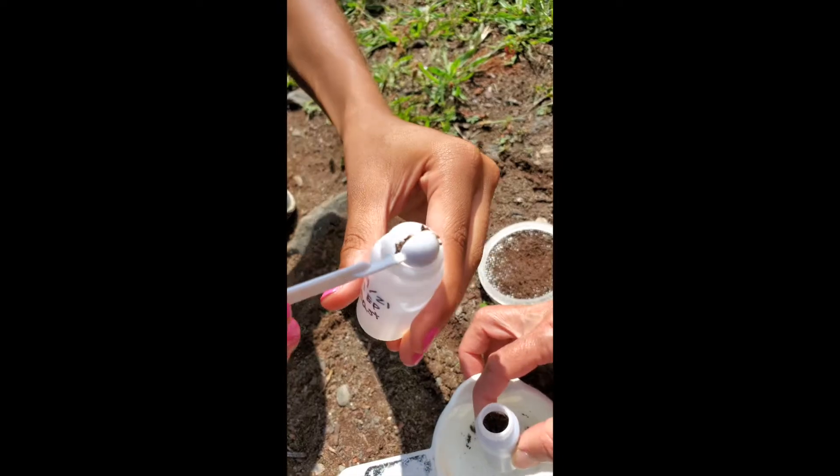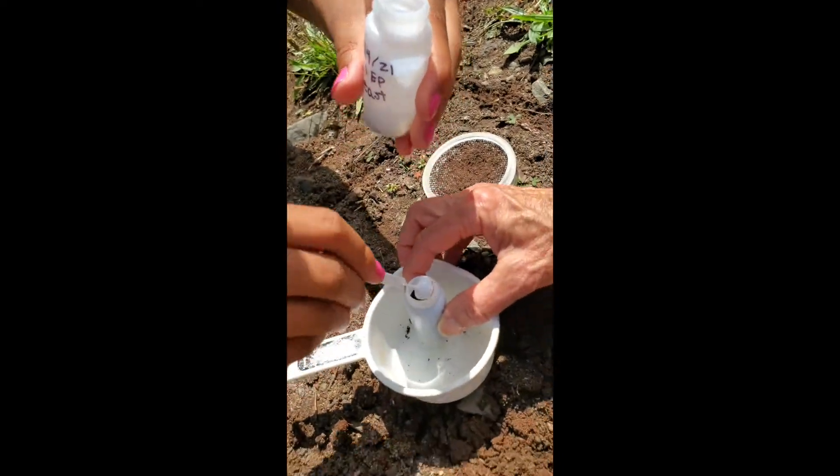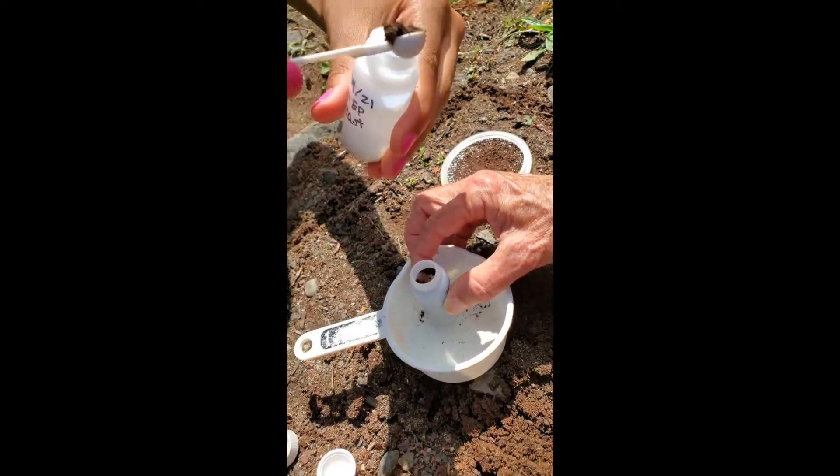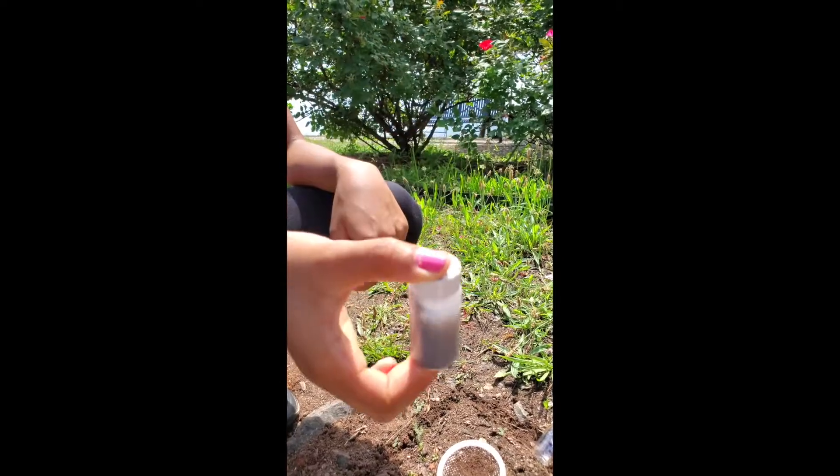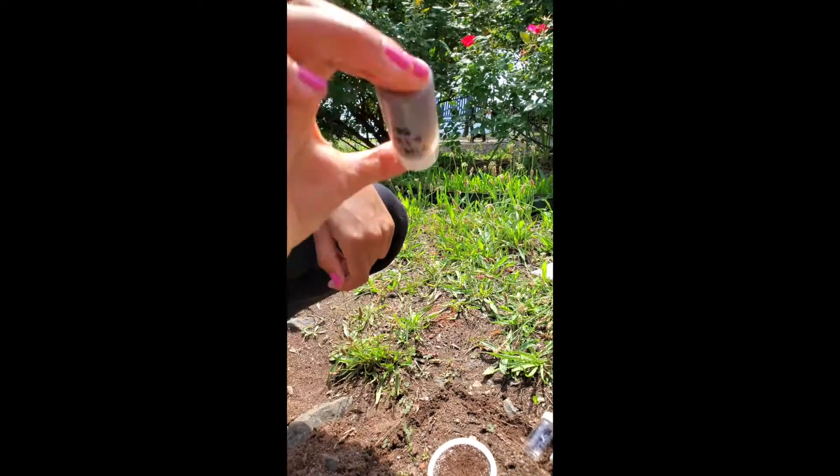After, we put about three small scoops of the sifted soil into an acid solution and slowly shook it for 30 seconds, then waited 45 minutes for the soil to settle and shook it again for another 30 seconds.